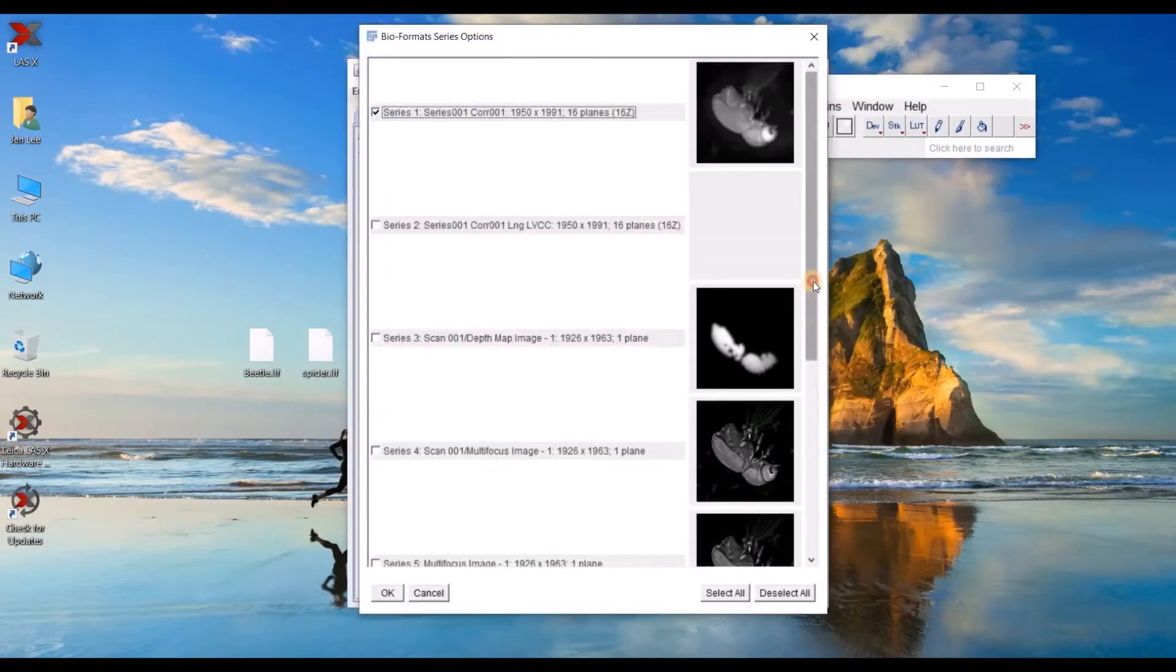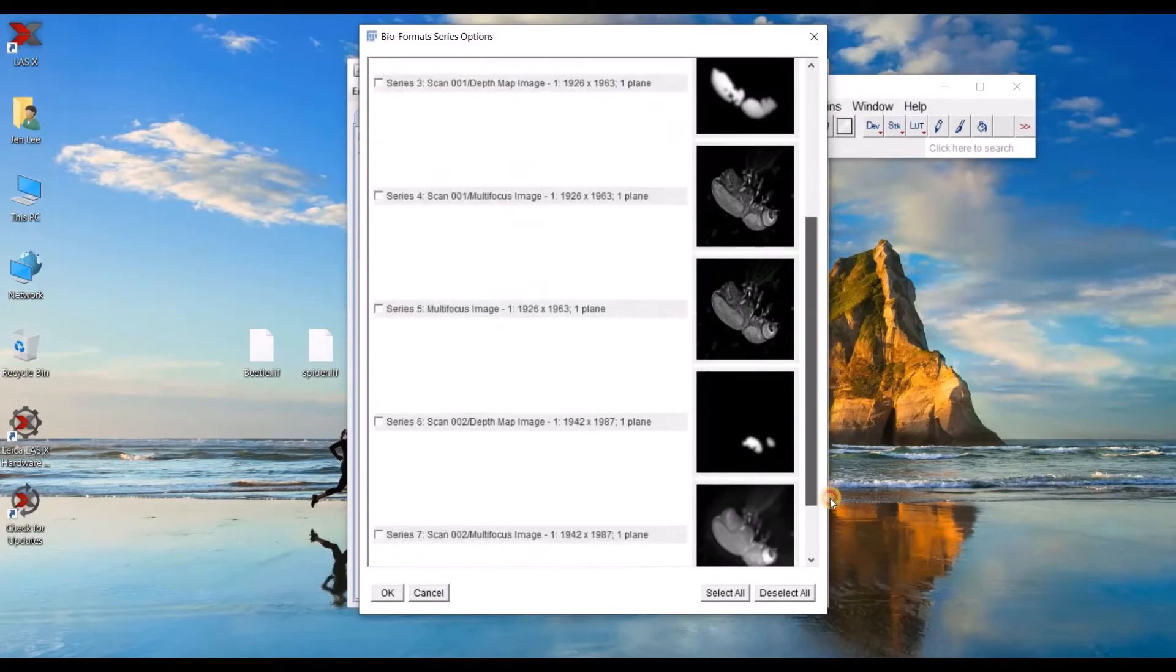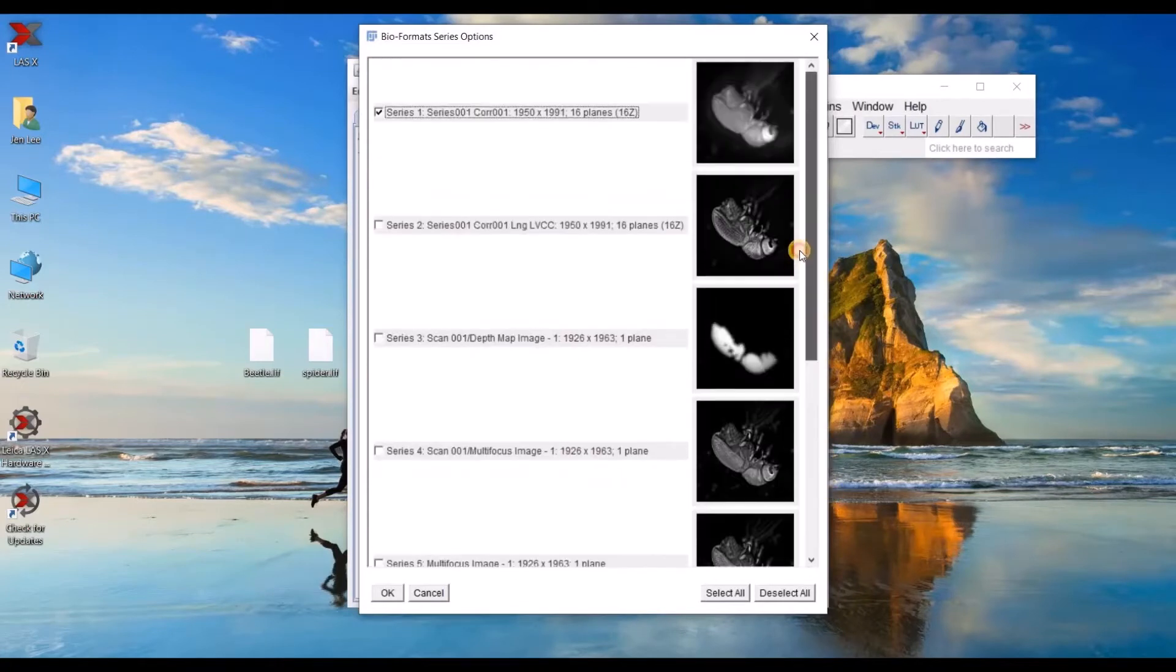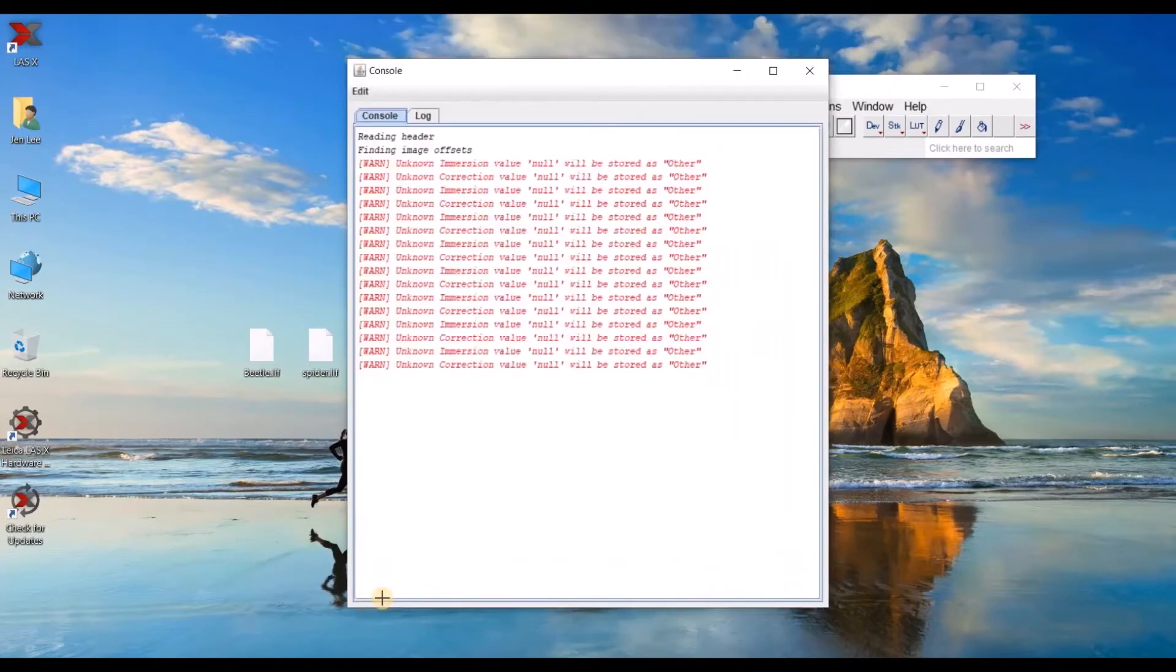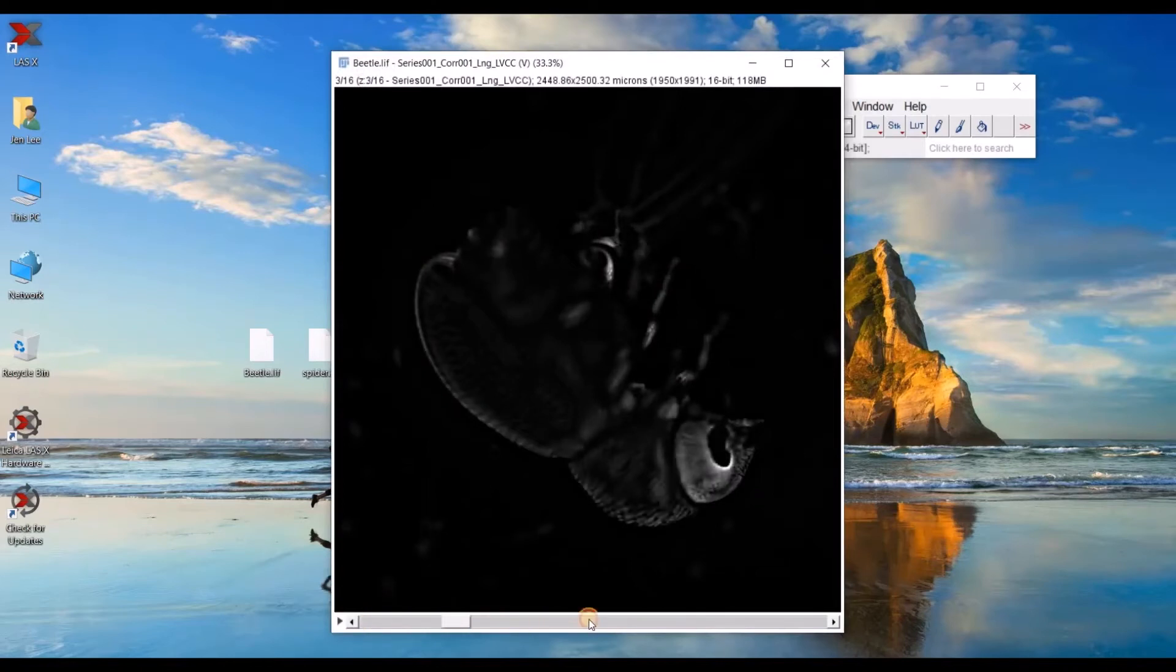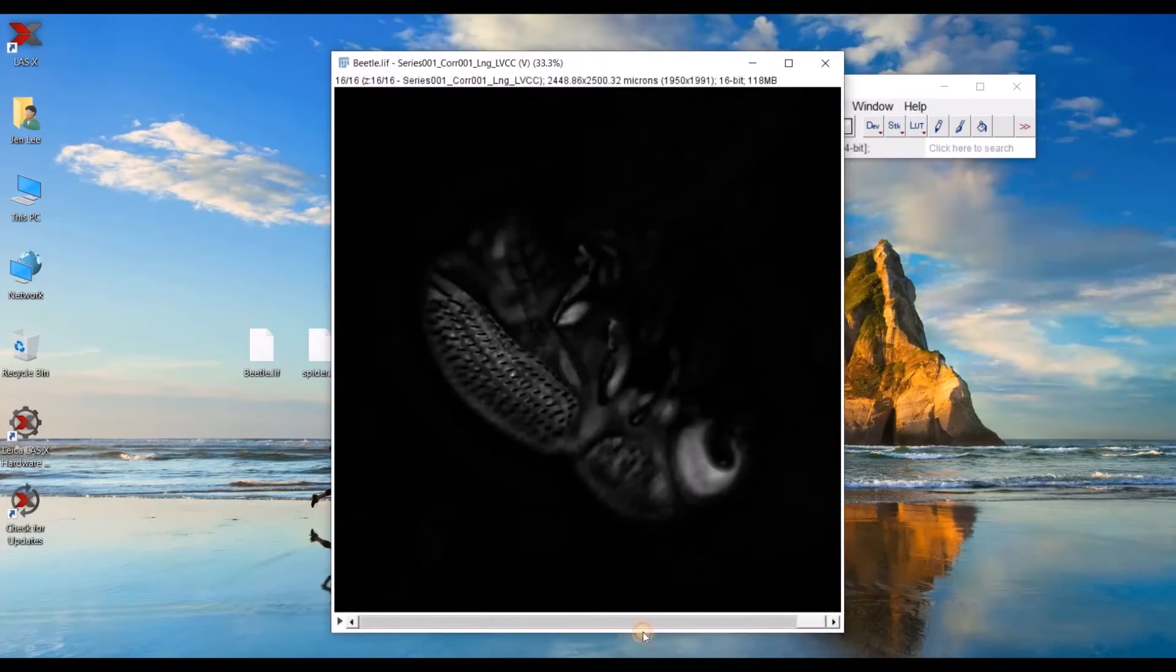You can see that under my project file, I have a bunch of different images. They open as these thumbnails. And then I can go ahead and select the series that I want to open, which happens to be a Z-stack image. At the very bottom, this is how I scroll through my Z-stack.